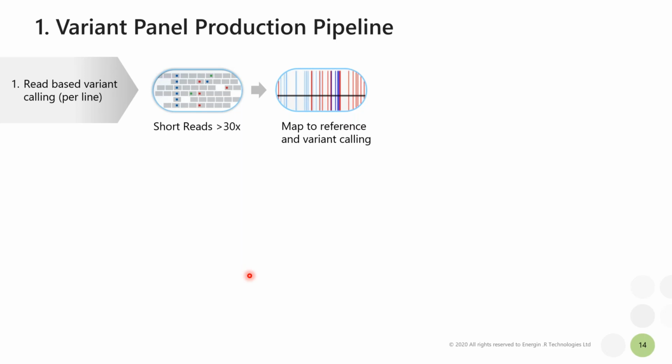The problem in this case, and actually in many other cases of plant genomics, is that there are shortcomings to this approach. One is the quality of reference that you are using. Second is the level of diversity that you are trying to capture, because aligning reads in cannabis and actually in other plant species may only account for 50% or even less of the reads mapping in high reliability to a single reference.